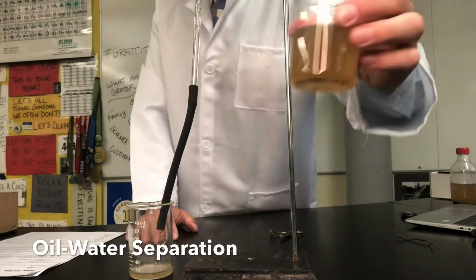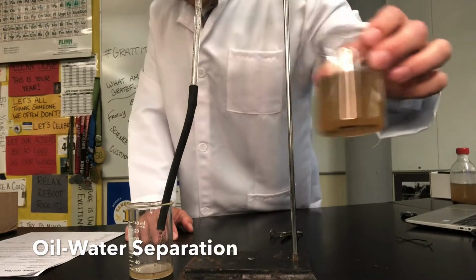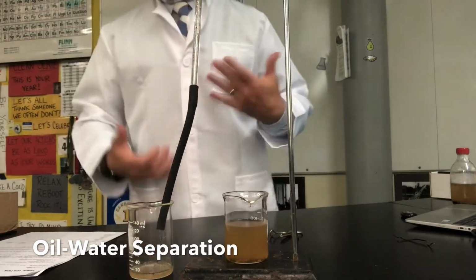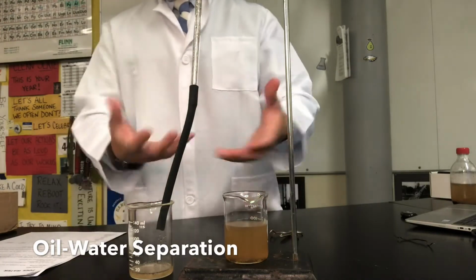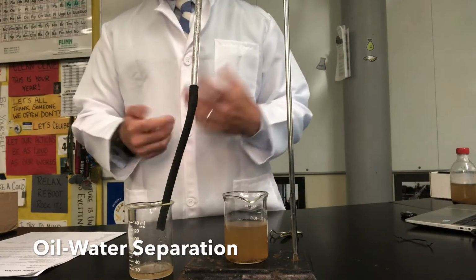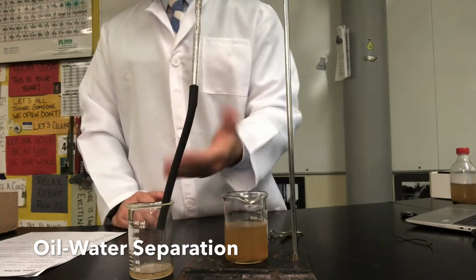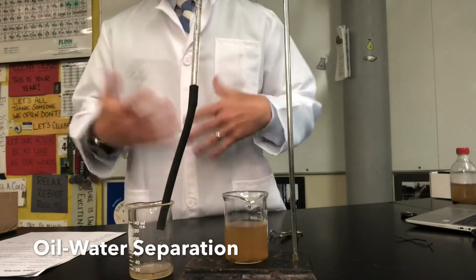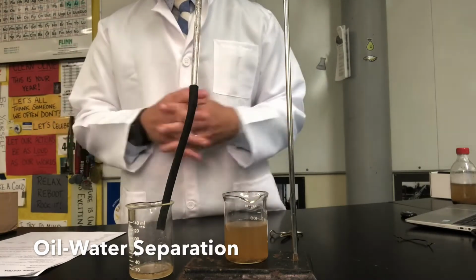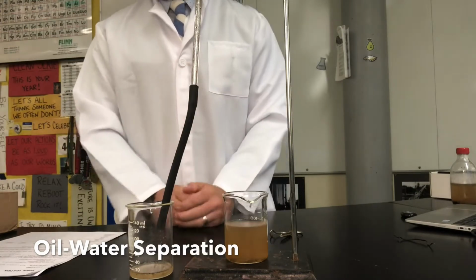Now, by doing that, we now have a slightly cleaner sample of water, okay? Because we got rid of the oil through physical separation. Remember, in a heterogeneous mixture, there's just a bunch of different things mixed together, and you can physically separate them in order to make something more pure or by itself. So we did a physical separation by taking out the oil. We didn't use a chemical reaction or anything crazy. We just used their densities to separate them out. And physical properties fall under things like density. So that was an easy way to figure that out.